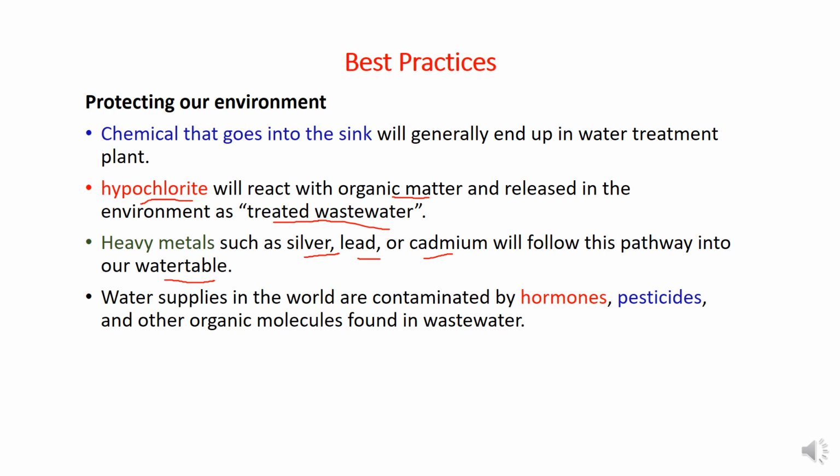And similarly, certain water supplies, for example, if they are contaminated with certain hormones, pesticides, and other organic molecules in the groundwater, they can produce a lot of other diseases. That's why this is really important. While if we are specifically talking about laboratory conditions, don't drain any chemical into the drainage. Okay, so don't throw any chemical into the drain or into the sink.